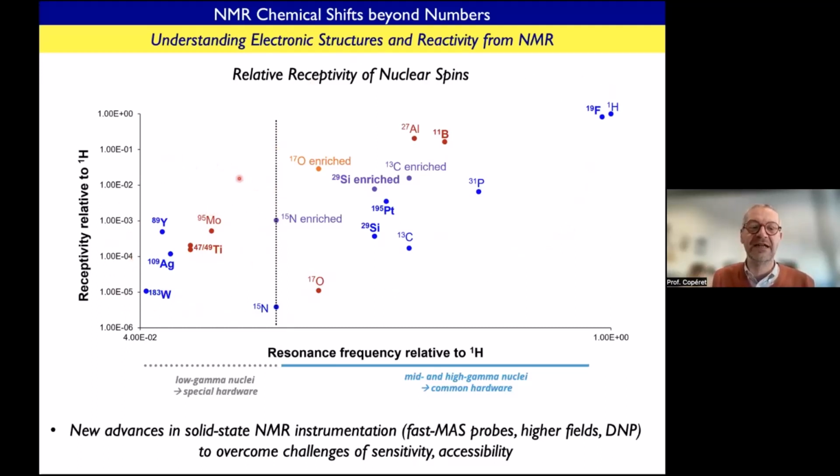So we got interested, even though some studies were done in the early 80s in this area. We acquired a probe in that area, and we decided to study molybdenum NMR, which is as good as carbon-13 in terms of receptivity. You just need a special probe. Either you make it yourself, or you talk to companies to help you build a probe to access this type of nuclei.